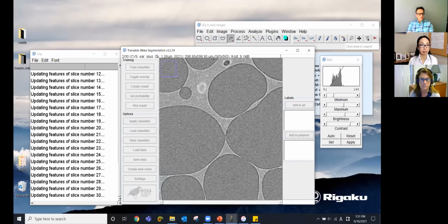Yeah, so actually this is a good one: can we apply different thresholds to different slices of a 3D image? Yes, you can do it one by one. And also, even if you use automatic thresholding, you can choose to use the same threshold across multiple slices or recalculate the threshold for each slice. You can do it either way.